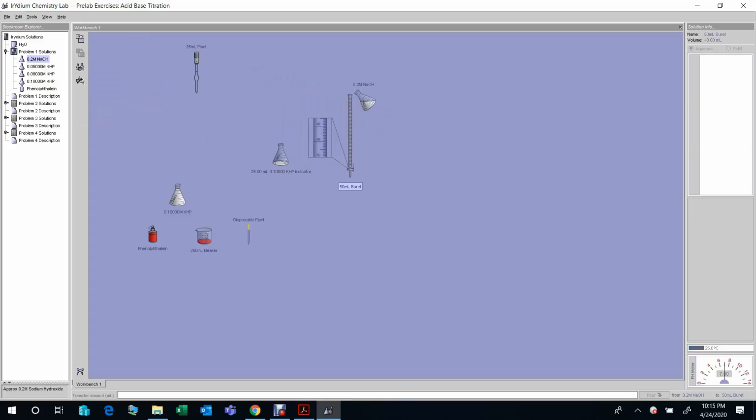There's one thing. Before I do the titration, you see the reading, the scale here is 50, 40, 30. So for a 50 milliliter burette, the 50 scale, the reading is over here at the bottom, it's not at the top. So we need to keep this in mind.